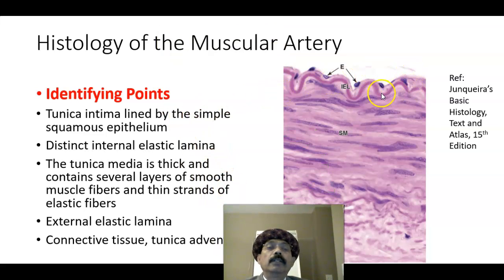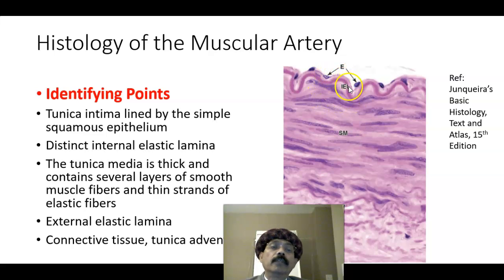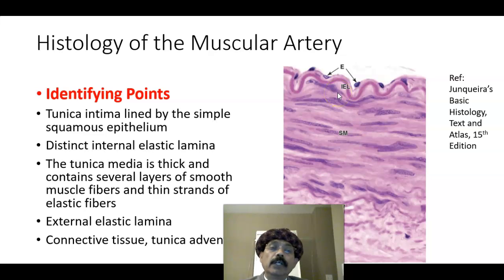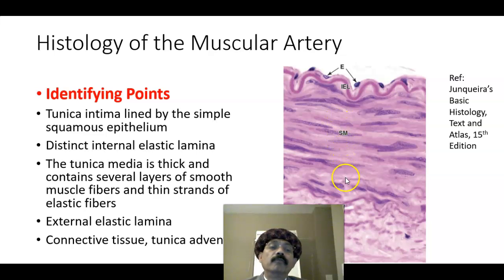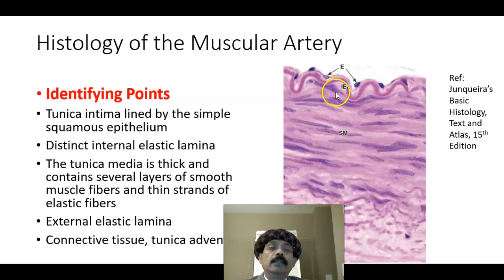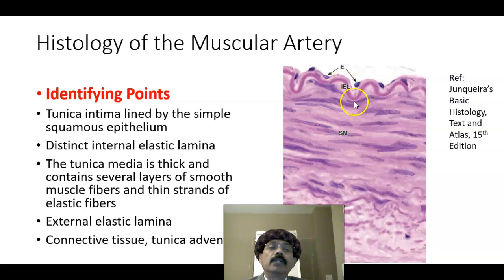The identifying points are the tunica intima, which is composed of endothelial cells and subendothelial connective tissue. Then we have the tunica media, composed of a very thick layer of smooth muscles. The tunica intima and tunica media are separated by a very distinct internal elastic lamina.